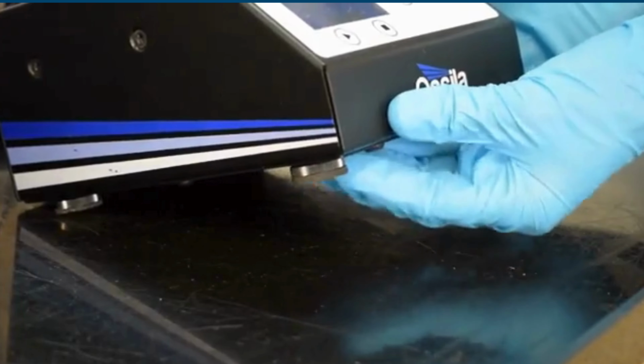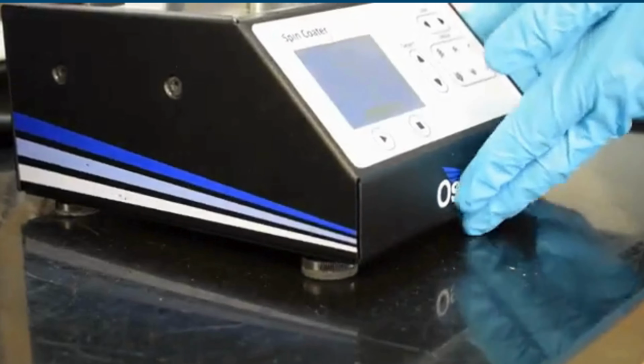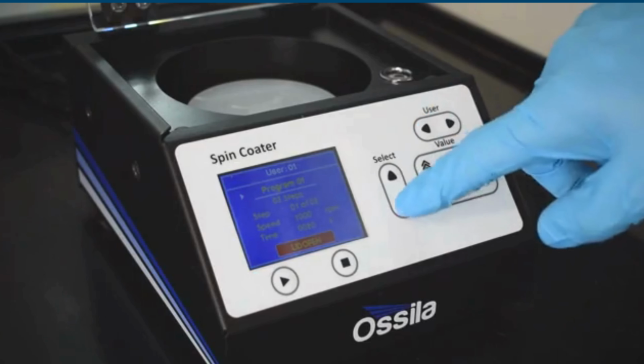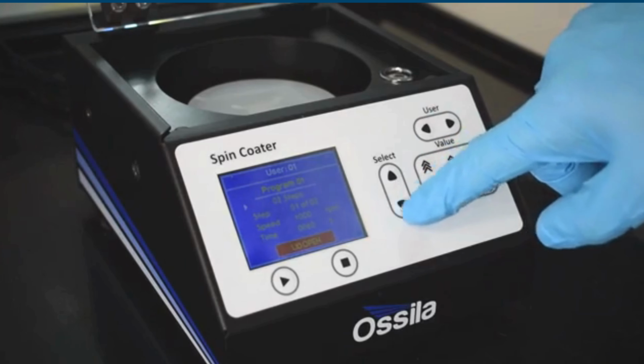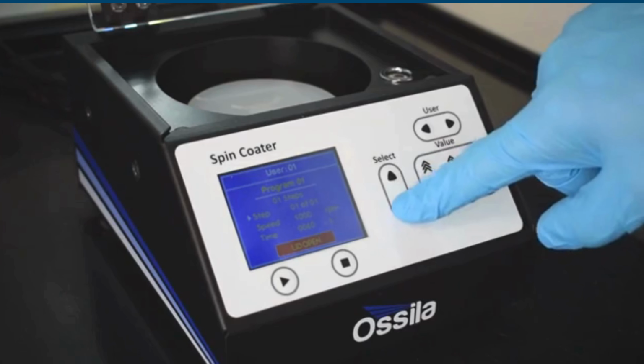The process begins with the preparation and filtration of a homogeneous polymer solution to remove impurities. A small volume of the solution is then dispensed onto the center of a clean substrate. Upon rotation at high speed, the solution spreads outward and forms a uniform layer.